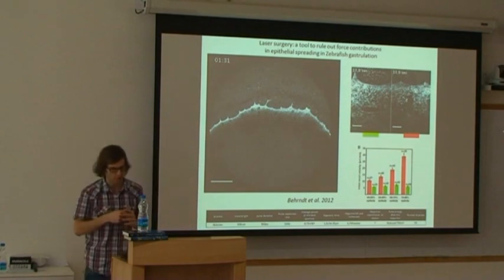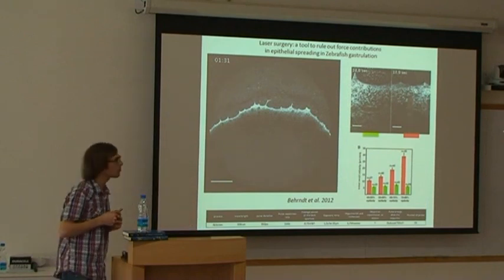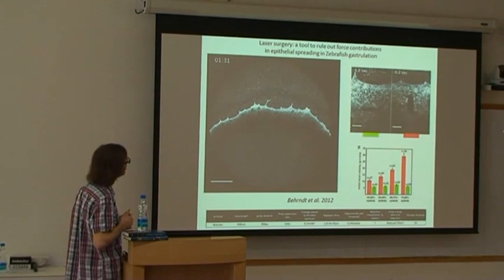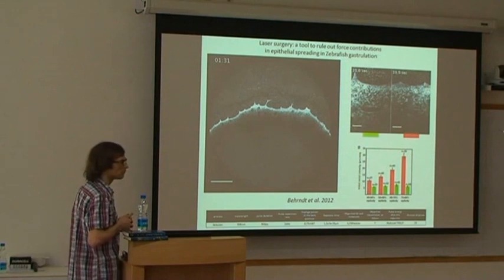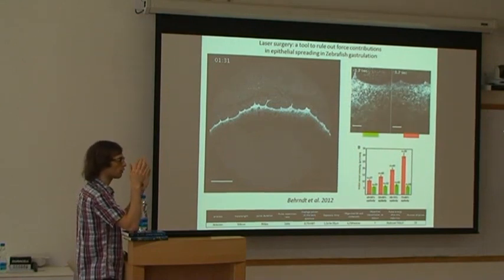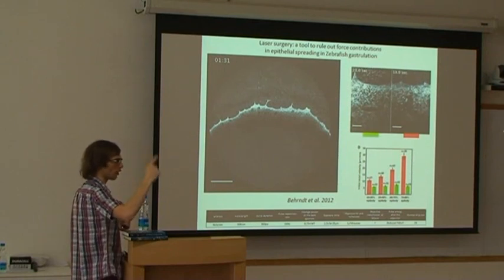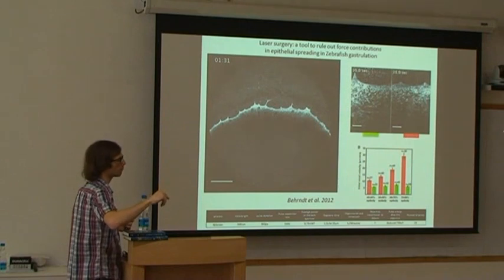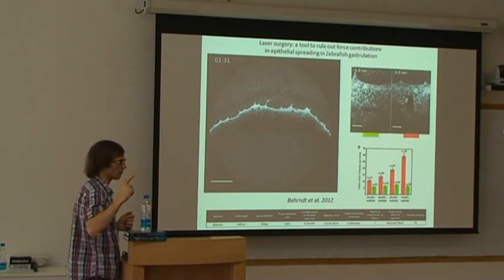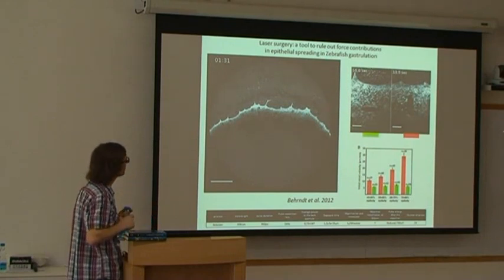But now I would like to be more critical about this laser dissection. It does a line dissection. It uses micro mirrors. They can be displaced, and it will just draw a line, probably with a software, I think its own, maybe commercial software, and it will scan very, very rapidly on the line.